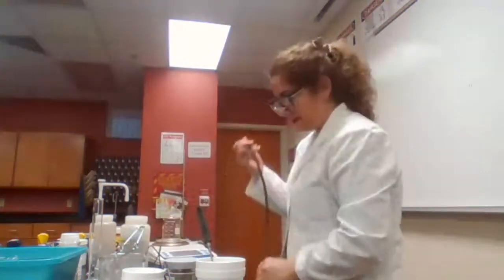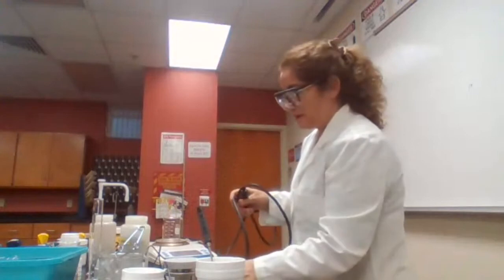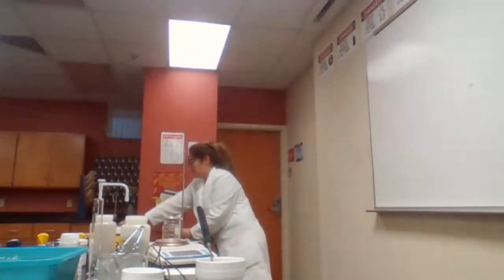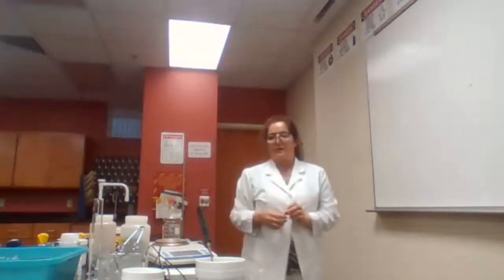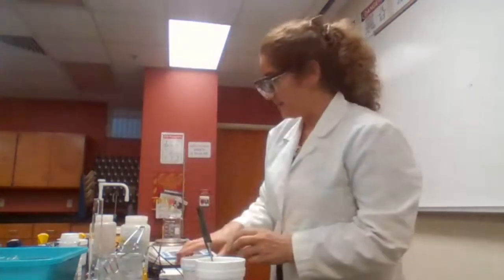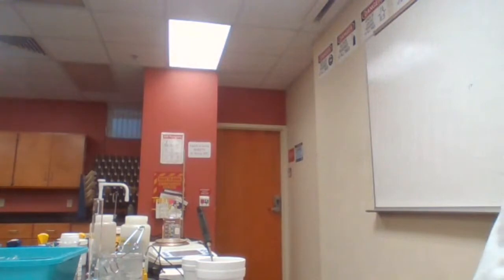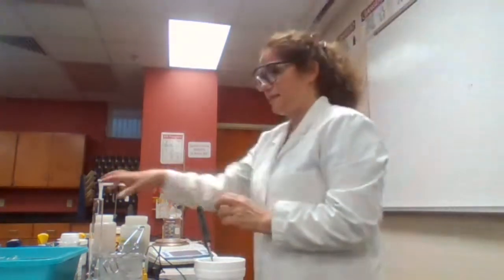Part B of the experiment, I'm going to move the hot plate somewhere. For part B of the experiment, what is it that we need to do? You want to help me with part B? For the procedure, ten milliliters of DI water in a styrofoam cup.